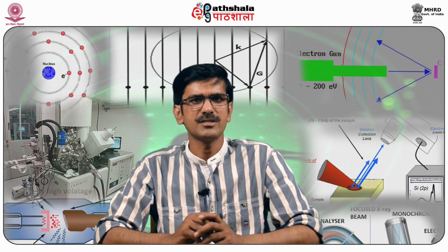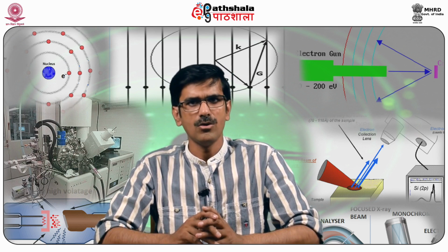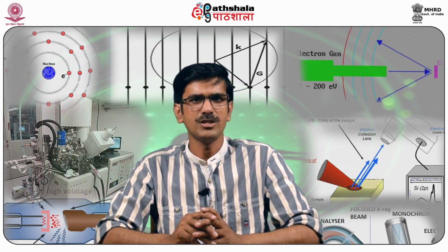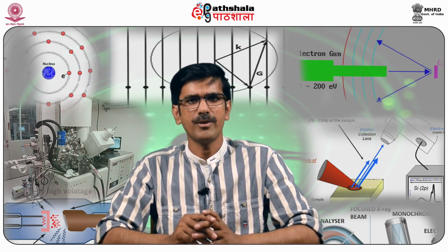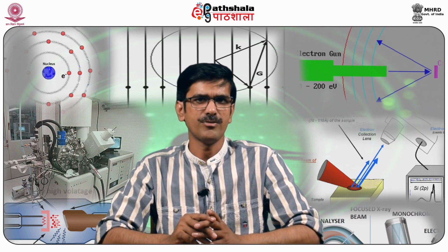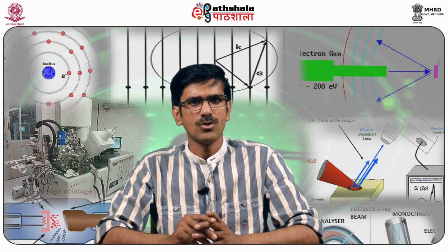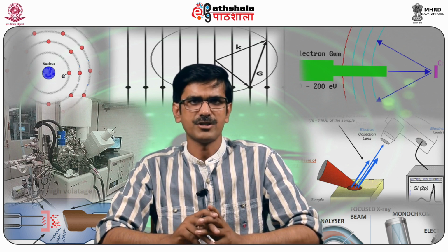In quantitative analysis, from the name, we can guess what we are going to deal with. Quantitative means we are talking about the quantity of the material or the sample. It can be obtained from X-ray count in different energy levels. On the basis of analysis parameters and the sample composition, semi-quantitative results are easily available without standards with the help of mathematical corrections.